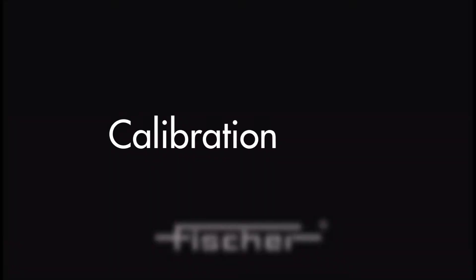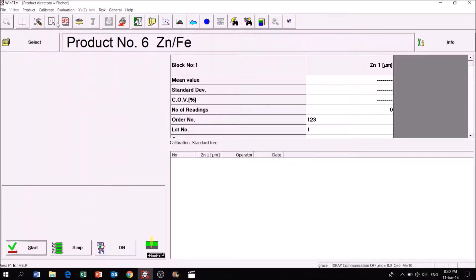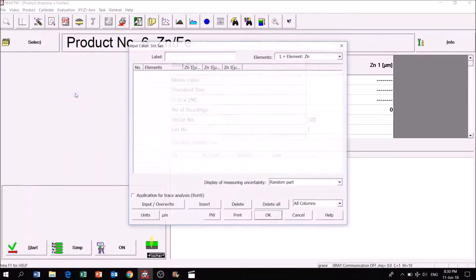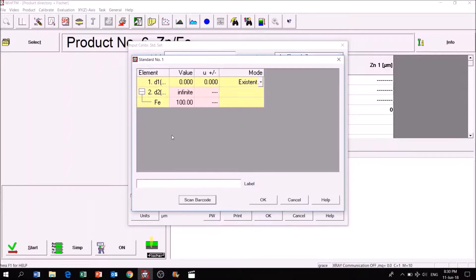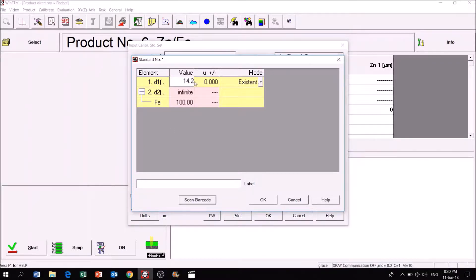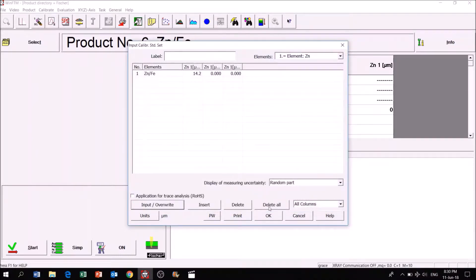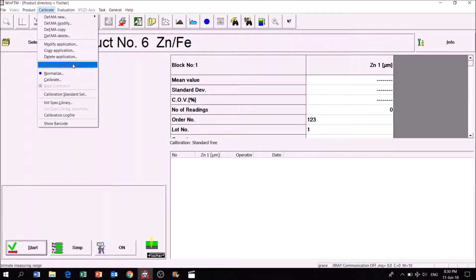If you would like to get a more accurate reading, use the calibration setting. When using this setting, the measurement system is adapted to the specimen's characteristics. At least one calibration foil is used, but for the best accuracy, two calibration foils, one above target value and one below, should be used for calibration.